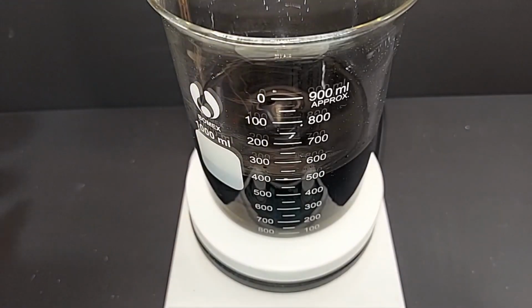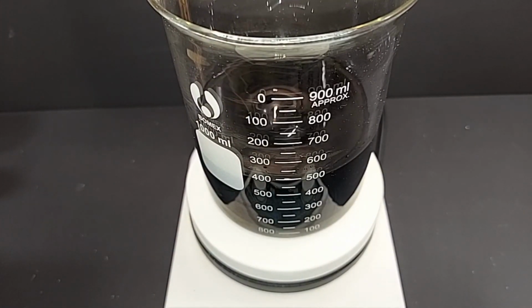What I'm going to do is divide what I have here into 1/3 and 2/3. 2/3 I'm going to just continue on to get the copper 2 chloride out, which I think I know how to do. With the 1/3 though, because I do believe there's copper 1 chloride in here also, I'm going to try to get copper 1 chloride out of the 1/3. I didn't plan on this, but since it's like this now, let's go ahead and try this moving forward.